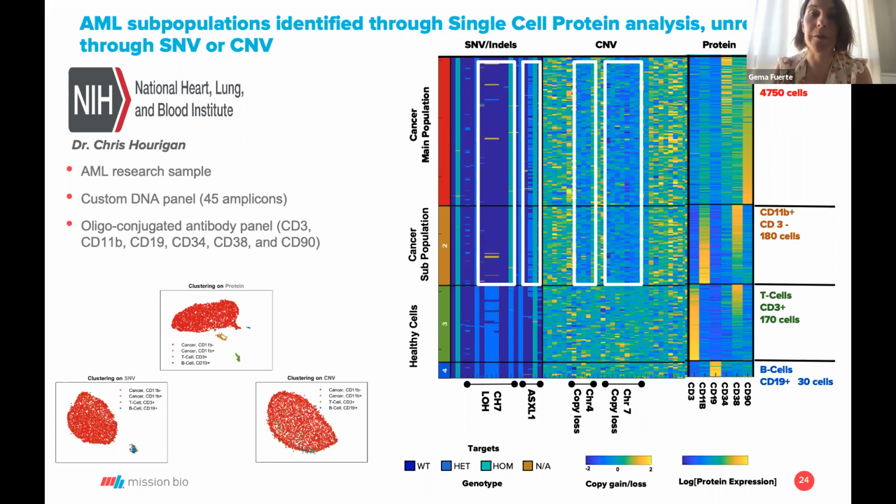As a follow-up to that, how many amplicons would you recommend to cover a certain region? Yeah, it depends. If you're interested in a specific somatic mutation, as an example, HER2 amplification in breast cancer, you could get away with 3, 1 for your mutation and 2 in the flanking regions. But as usual, the more the better.